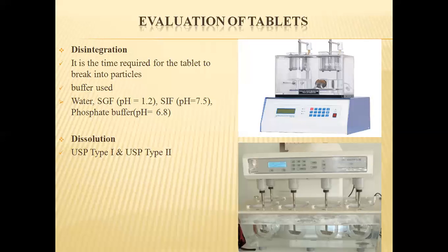So that is all about dissolution testing. In case of dissolution also, we can use different buffer solutions depending on the type of the tablets or the type of the drug we are using and their solubility. So these are the official tests for tablets.